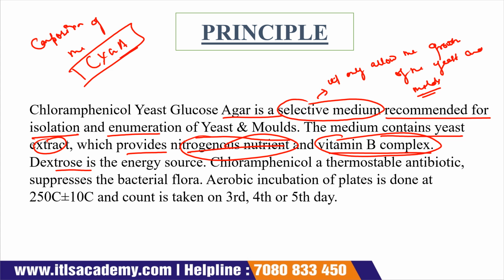Dextrose is used as an energy source, and chloramphenicol is a thermostable antibiotic which suppresses the bacterial flora.